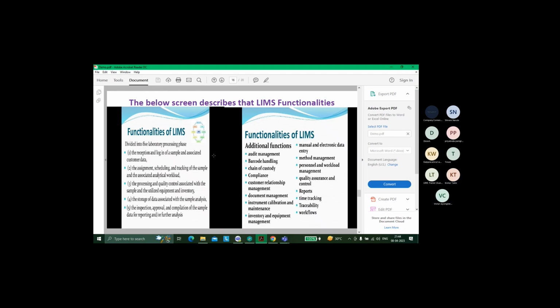Yeah, but HPLCs and GCs, I don't know. What I know of HPLCs in LIMS labs, HPLCs and GCs are connected to Empower. Okay, Empower or your chromatographic instrument takes your chromatographic data, and Empower is connected to your LIMS. From Empower, your data goes to LIMS. Yeah, their interfaces are made. That is Millennium 32 interface. Okay, so that is how that works.